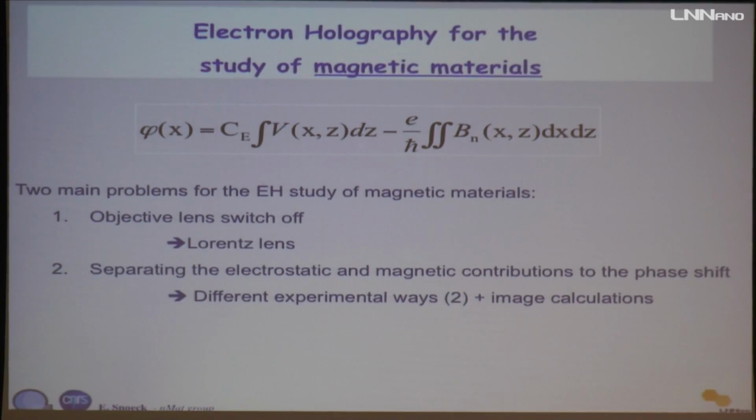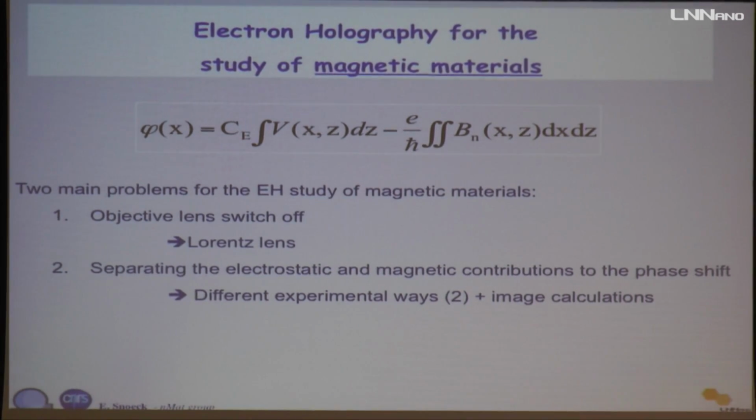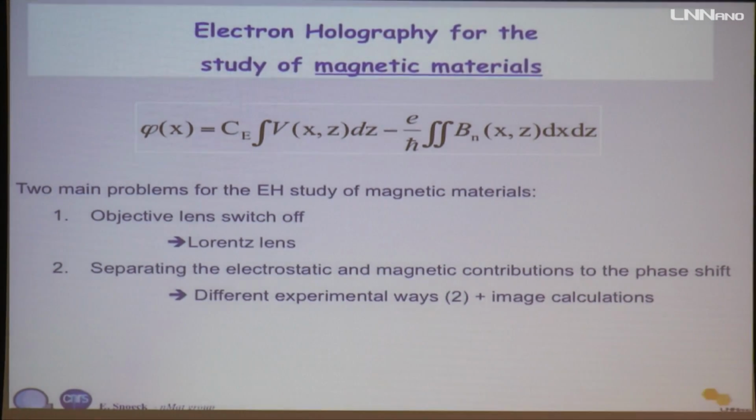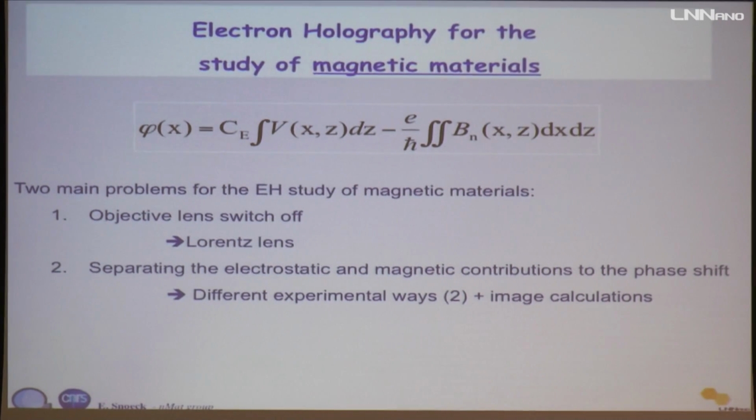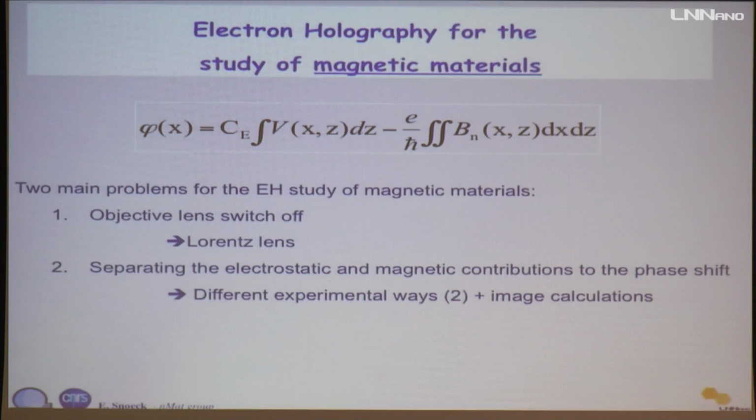You know that these magnetic lenses are used to bend the electron beam in order to have optical characteristics like any lens. The way you do that is with coils in which you send current in the objective lens, which creates a magnetic field, oriented almost parallel to the electron beam, and it can be very huge. It can be up to 2 Tesla at 200 kilovolts when you are using, in high resolution mode, the full capacity of the objective lens.